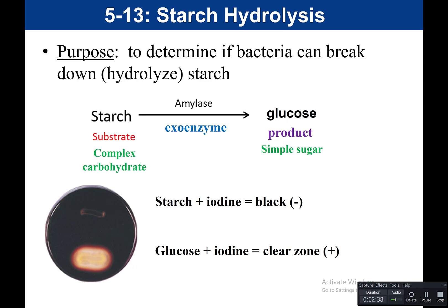For this test, our reagent is iodine, which detects the presence of starch. If starch is present, iodine will change color. Iodine alone is an amber or golden yellow color. When starch is present, iodine will react with the starch and turns black. Remember, this is a starch plate — the plate has starch in the media.